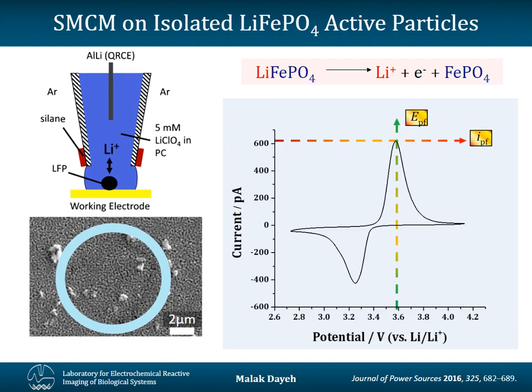One of the reasons why we ended up choosing voltammetry rather than galvanostatic type of measurements is because we are going to acquire an enormous amount of data, and it's much easier to automate data treatment algorithms using peaks. And so with the CVs, it's easy for us to automatically extract the potential of the forward peak or the current of the forward peak. And it's also possible to extract the charge using the CV.